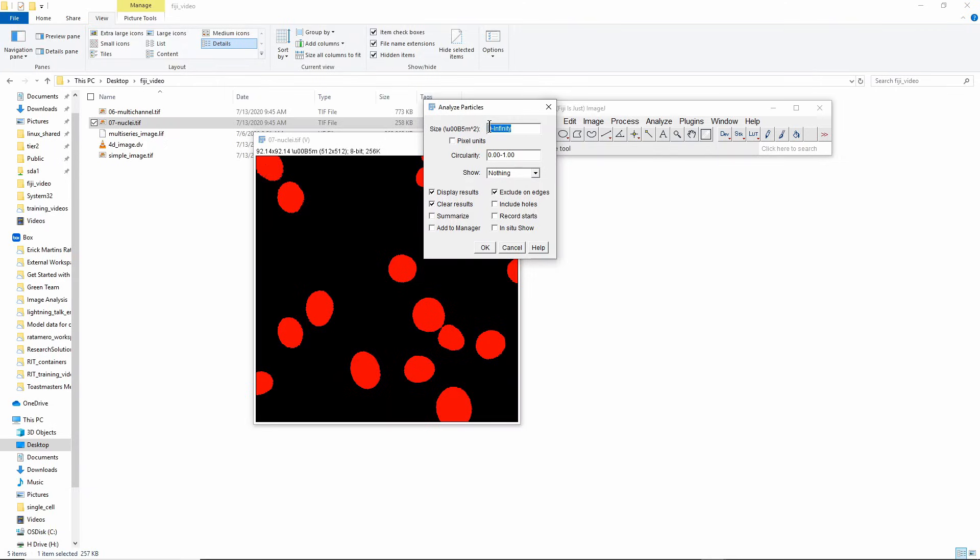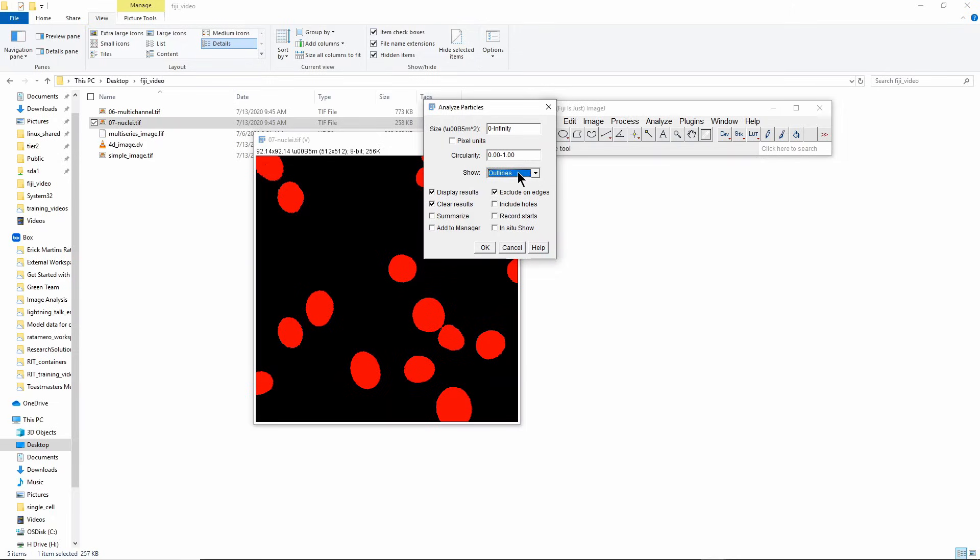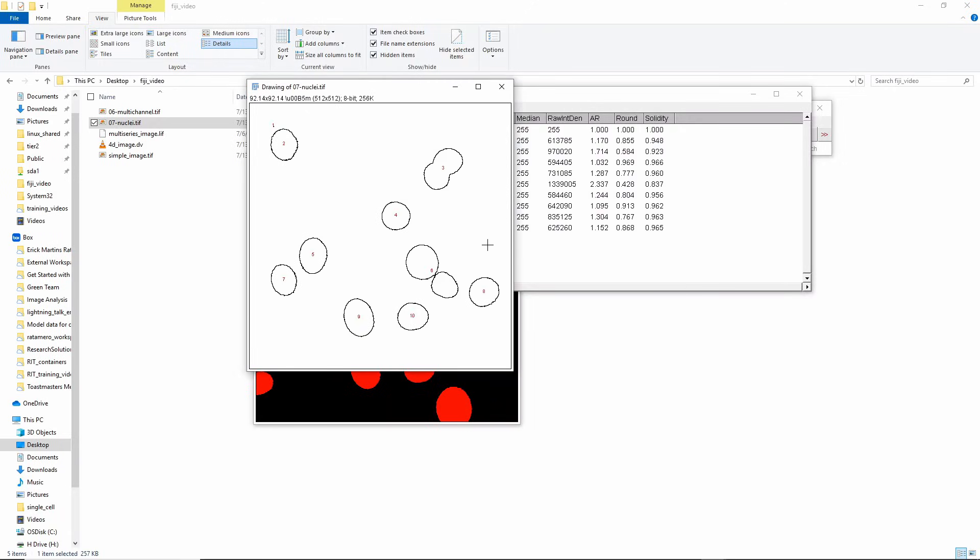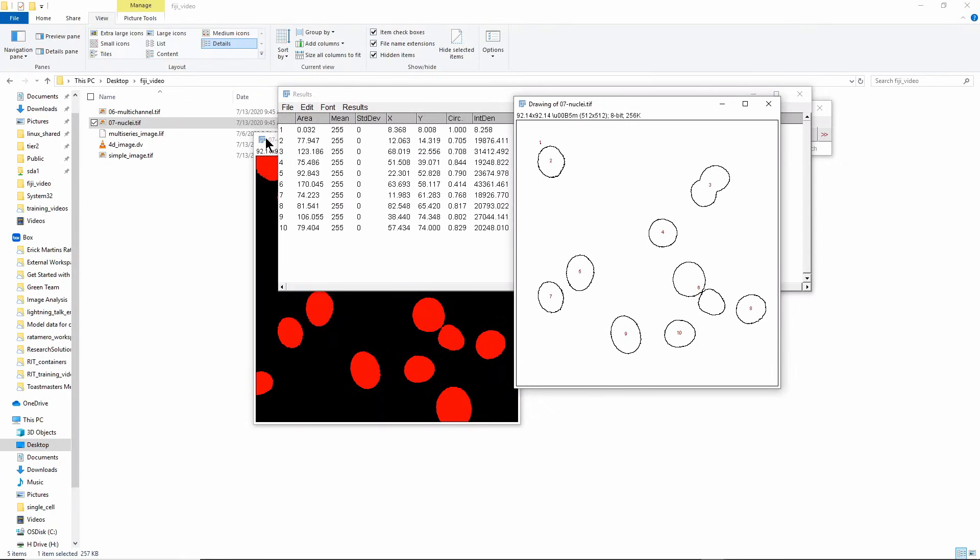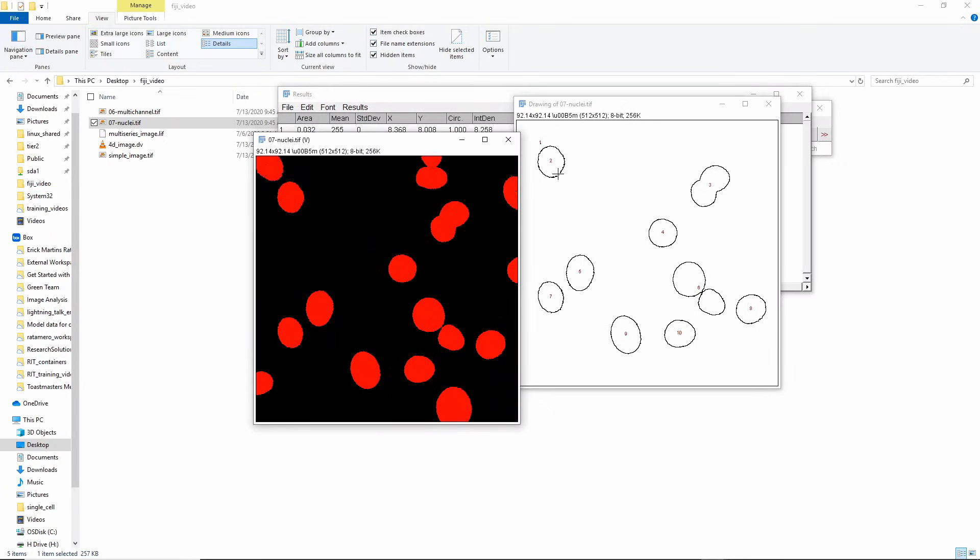There is a lot of things you can do here. You can filter things by size, so for example you can filter very small things that tend to be the background. You can change what the output is going to look like, so I'm going to show it as outlines here. There are things like for example exclude regions on the edges, you can include holes, you can add them to the ROI manager which is a very useful tool, and so on. I'm going to press OK.